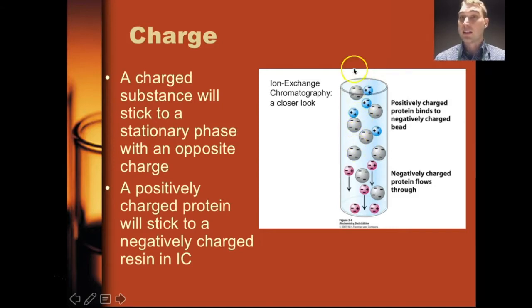Whereas a substance that has the same charge as the surface of the beads will pass straight through because it's repelled. So here we have a negatively charged substance. The beads have a surface with a negative charge, so it just passes through because they repel each other.